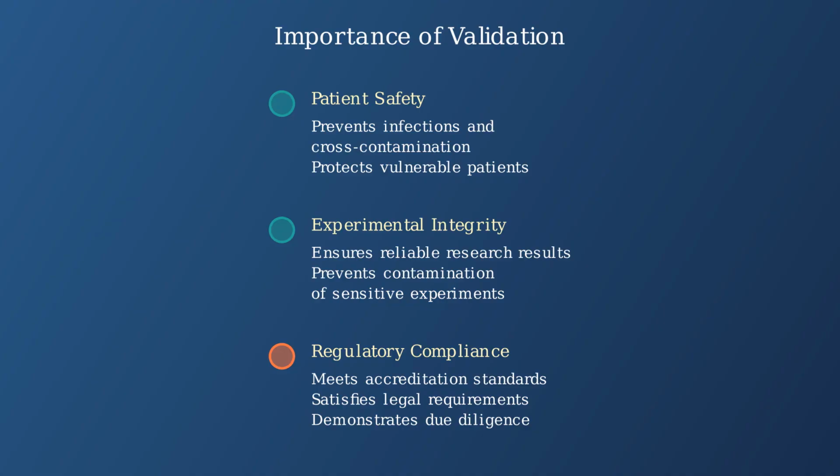Remember, without proper validation, sterilization cannot be confirmed, putting patients, experiments, and your organization at risk.